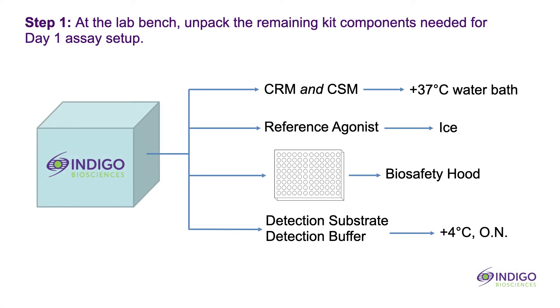Back at the lab bench, remove from the kit box the tubes of cell recovery medium and compound screening medium. These may be transferred directly into a 37 degrees Celsius water bath. Also retrieve the vial of reference agonist and place it in an ice bucket. Retrieve the white 96-well assay plate and place it in the biosafety hood to equilibrate to room temperature. The remaining kit components are a tube of detection substrate and a tube of detection buffer. When the two tubes are combined, they generate the luciferase detection reagent, which will be used on day two. These two tubes may be stored overnight in a dark refrigerator for use the next day.